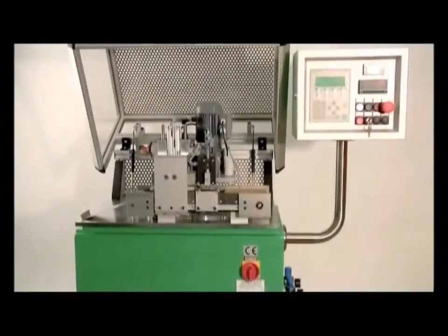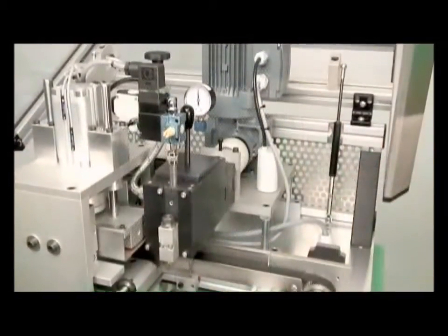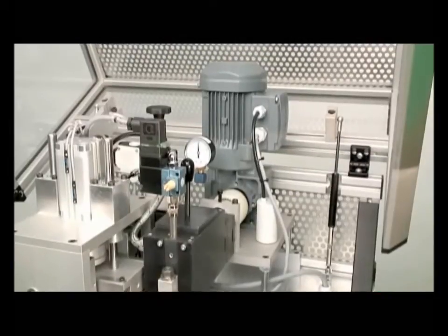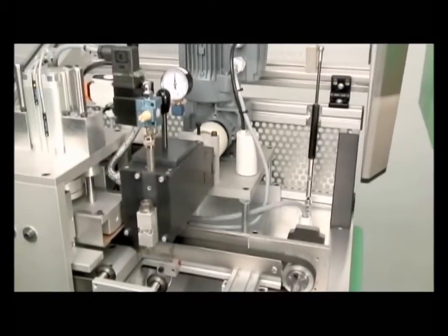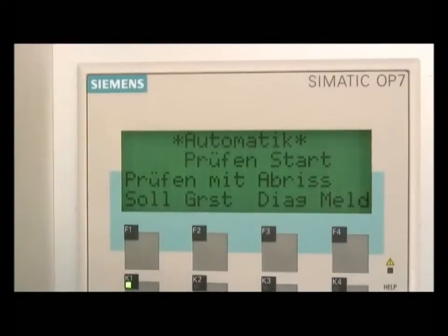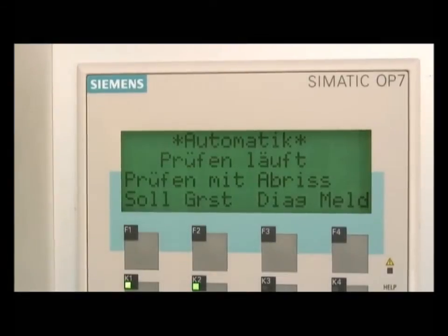Many adhesive parameters are tested only visually or manually. The results of these tests are difficult to reproduce. We would like to present our developed glue testing system where nothing is left to chance.